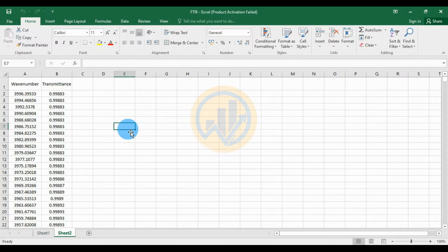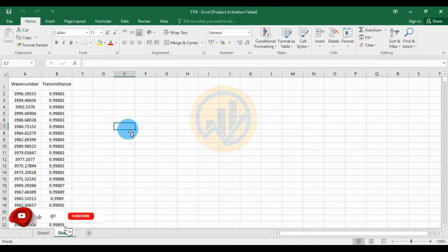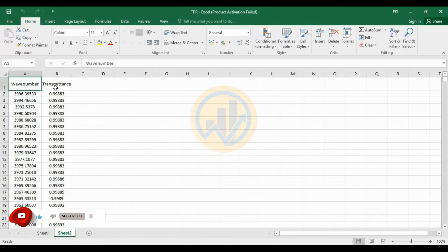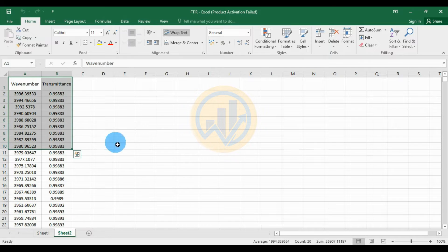Hi everyone, welcome to Statistics Biosound YouTube channel. I am Dr. Mohanasundari. Today we are discussing the topic: how to draw an FTIR graph in GraphPad Prism software. This is for the FTIR data in the Excel sheet.